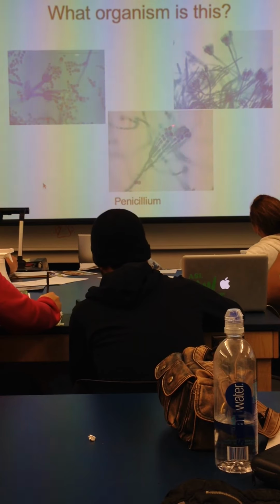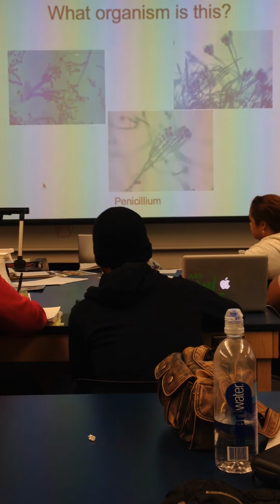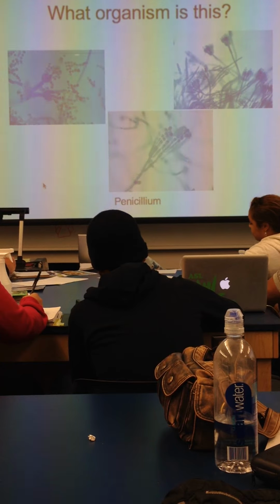And then up here we have all the spores. So this guy looks a little bit like a plant, but is actually a fungus. Okay, so we looked at the slide of this, and then this is the one we also looked at in the Petri dish, and we looked at it eating the bacteria. Okay.